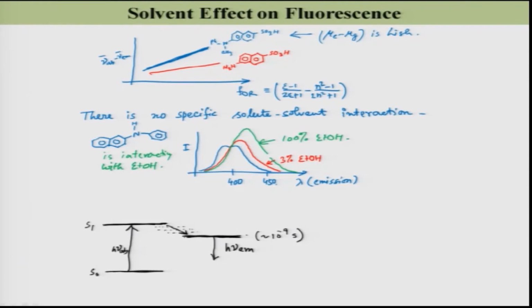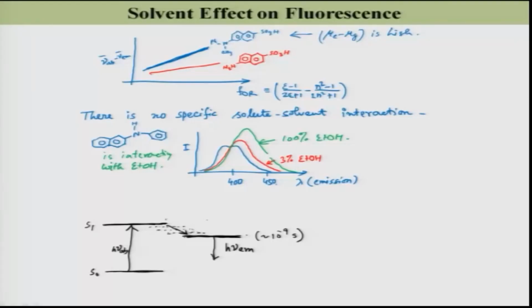If this process is slower, then each and every state will contribute to the fluorescence. So, whatever I said is true when this process is much faster than this process.